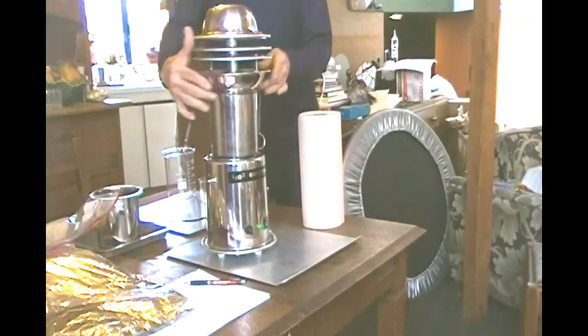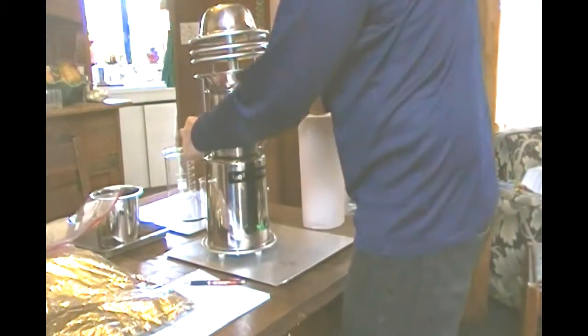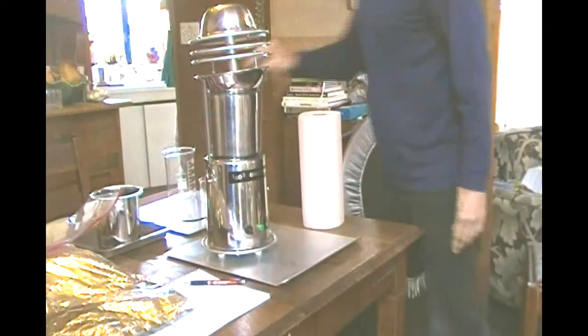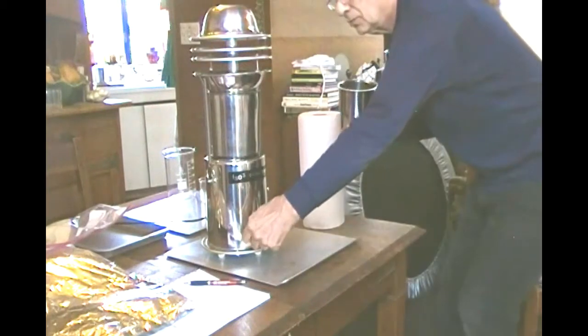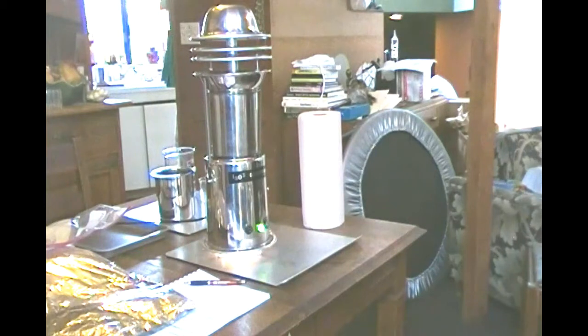We put the condensing unit back on, grabbing both of them together. Down they go and hook them over. We'll get some water now. We add the water to about an inch. We turn this on. We wait about 6 hours.